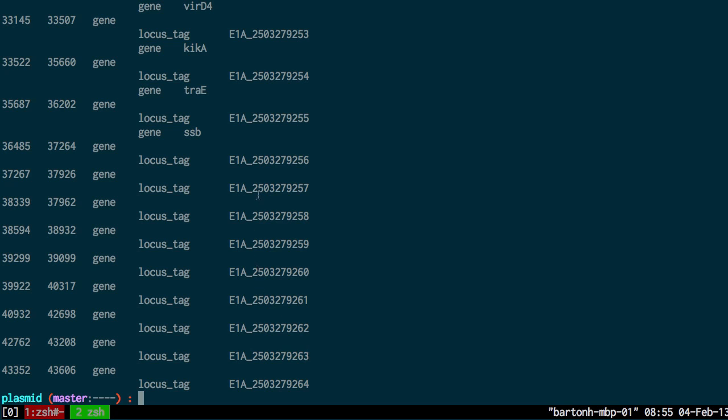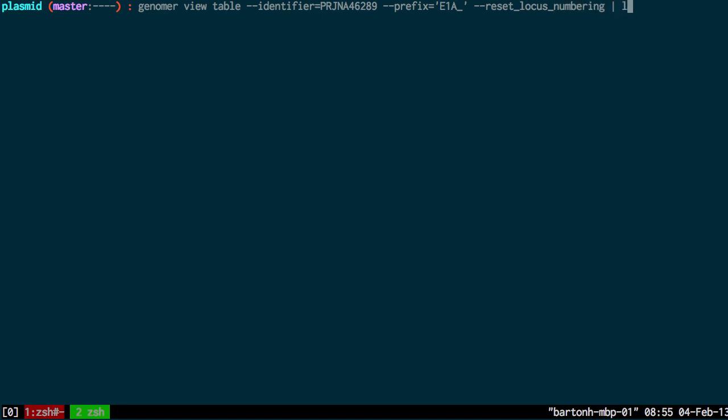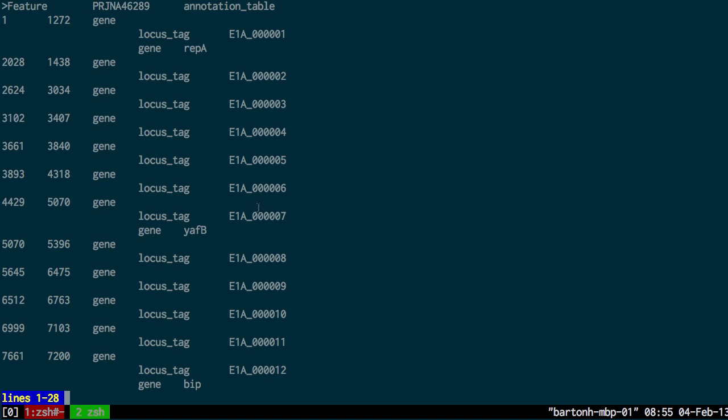This is not particularly useful because these IDs aren't very nice. These IDs have been generated by the annotation program. So I can update these by reset locus numbering. I'll put that through less again. You can see the annotation IDs look much nicer now. They begin at 1. The first one is labeled 1, the second one is labeled 2. That's much better.